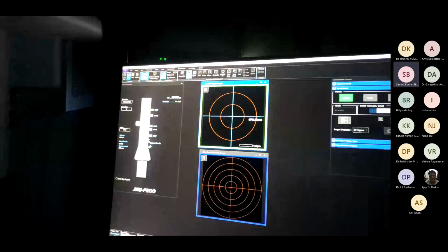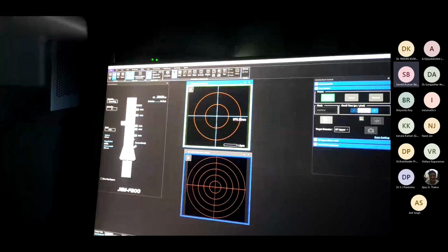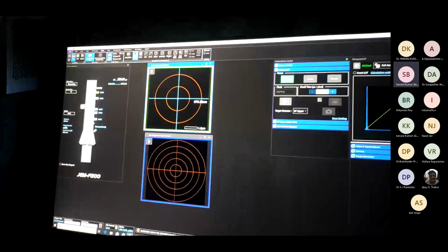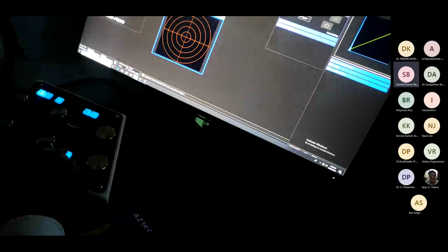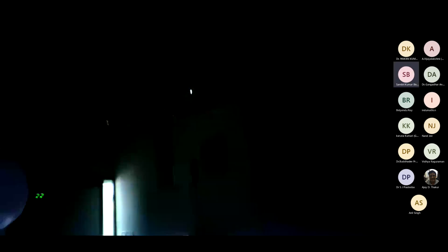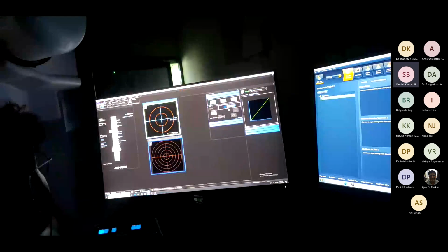I'm just removing this beam valve so that the beam can be incident on the sample. Now I have to press the standard focus. Binendu is helping me because there are some steps to follow. Next one is go to scan. Now I'm moving toward the scan.